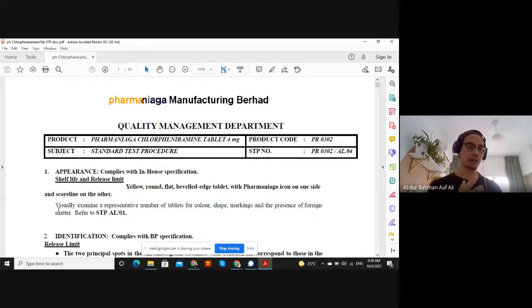So we have all the necessities untuk menggunakan pakai kaedah analisis yang ada dalam US pharmacopoeia. So I select the USP method untuk test chlorpheniramine untuk digunakan pakai as routine test. So every day kalau saya nak masuk makmal, saya nak test chlorpheniramine, saya just buka this STP because kita dah pilih based on our keperluan yang ada dalam makmal kita.